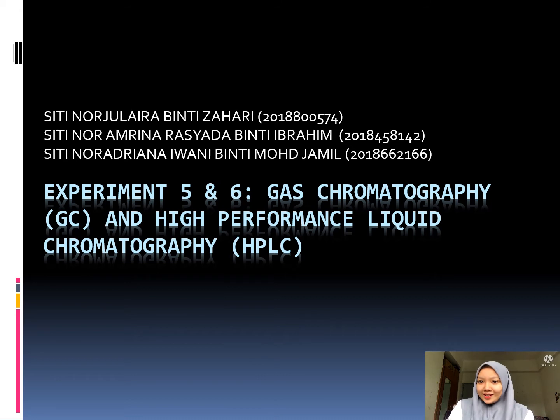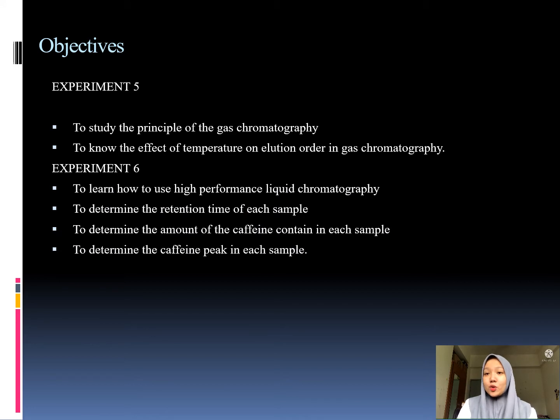Today, my friends and I would like to present about Experiment 5, which is gas chromatography, and Experiment 6, which is high performance liquid chromatography. So, I will start first with the objective of the experiment.